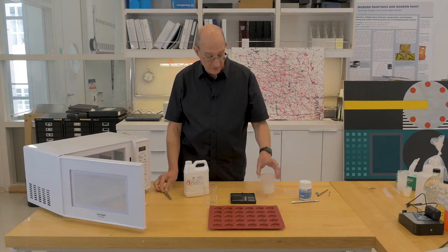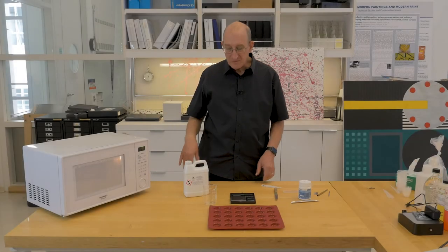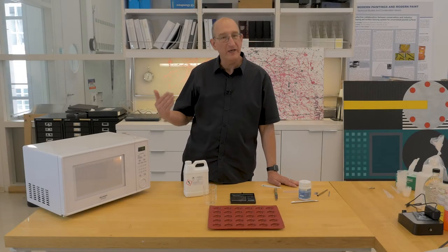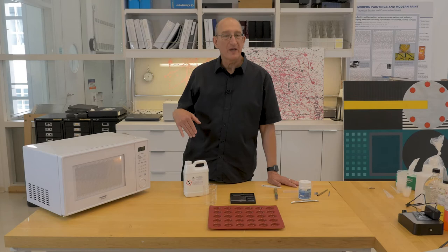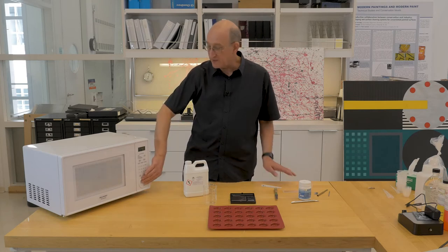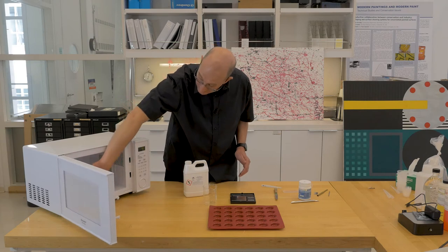Now we'll let this cool and gel, and then we'll melt it again using the same process. So we've let it cool and we're heating it up again, melting it again. It seems the agarose performs better if it's cooked twice, both for treatment and for better clarity of the gel. So here we have it melted again.